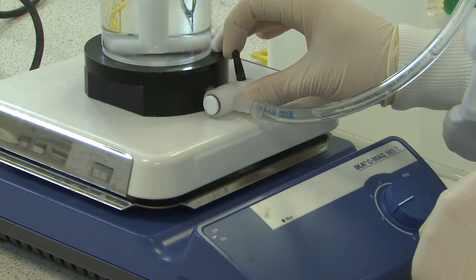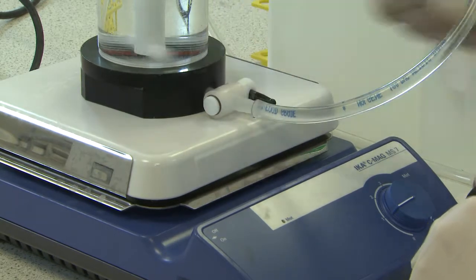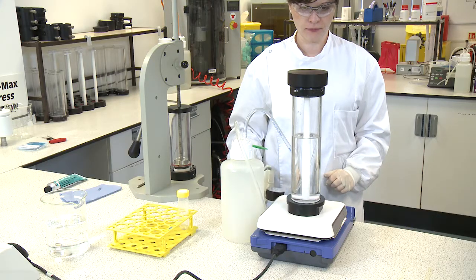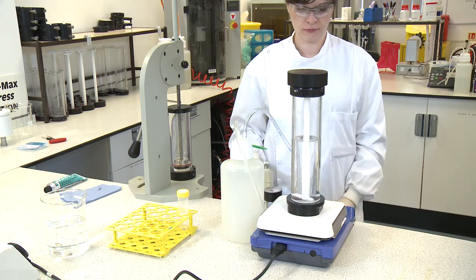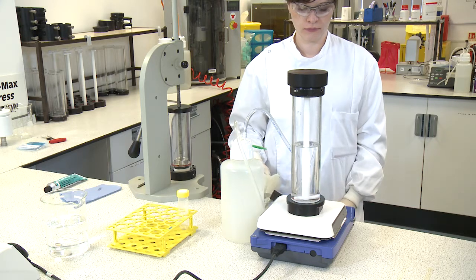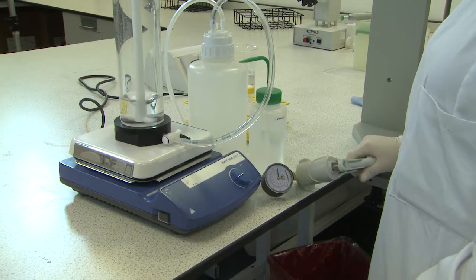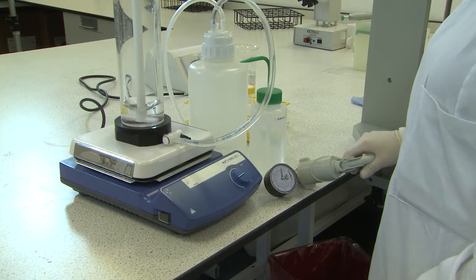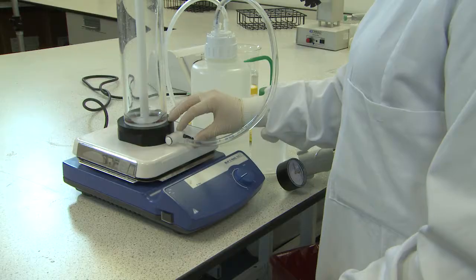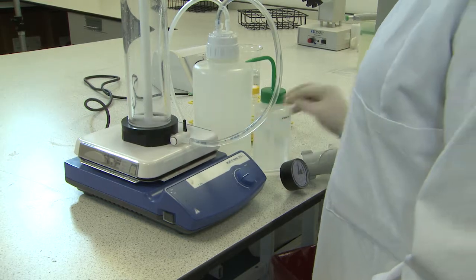Open the tap and carefully reduce the volume of liquid so that it's level with the follower, and then close the tap. Use the hand pump to create extra vacuum. The force of the vacuum should not exceed 30 centimeters of mercury. Note that not all liquid should be drained away. Oocysts and cysts should be suspended in the liquid above the membrane.